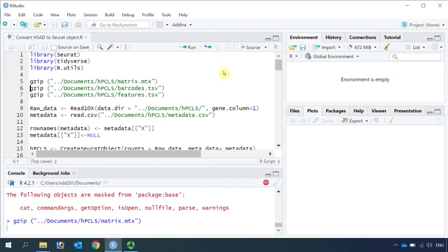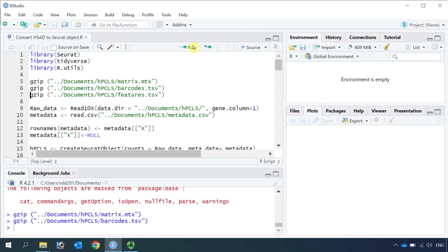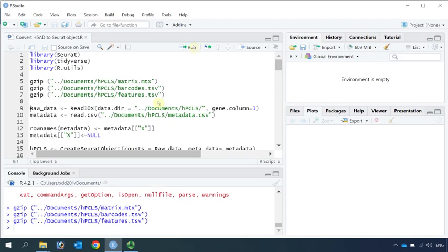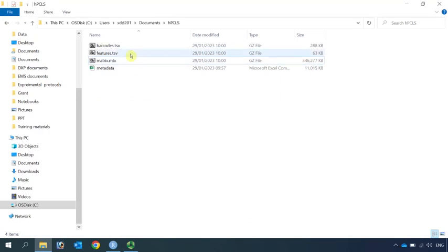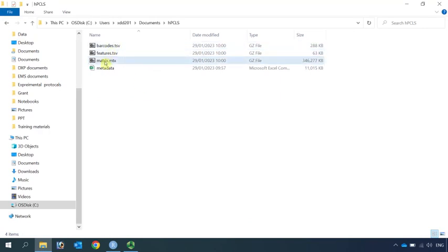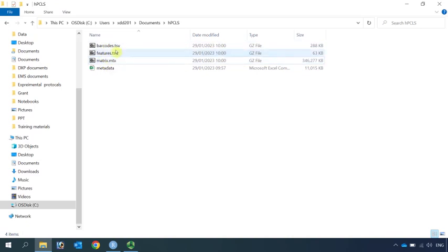The matrix data is quite big, so it takes time to compress it. It's done. Then we can compress the barcode and features files. Now you can see the barcode, features, and matrix have been changed to zip files.